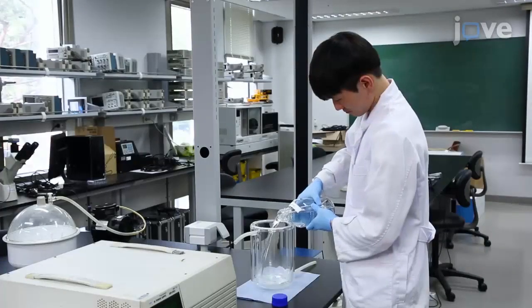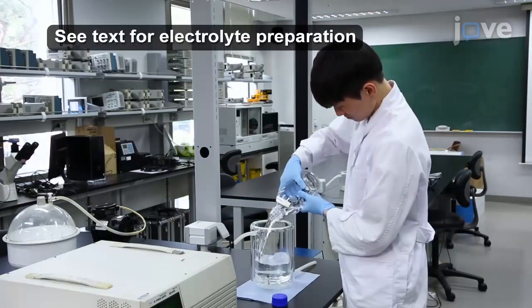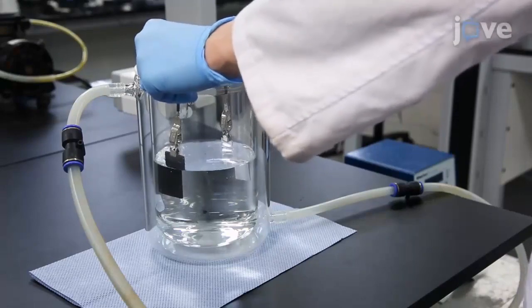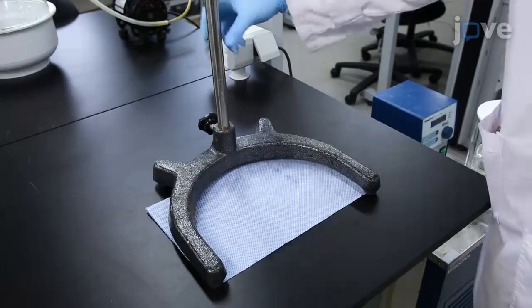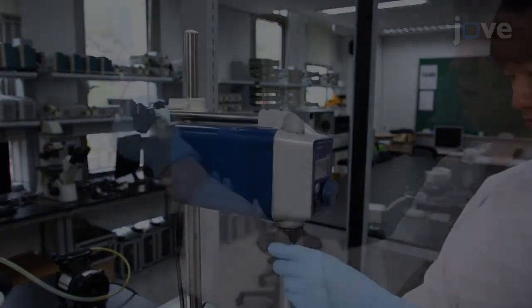To perform the primary anodization, pour 1 liter of the electrolyte into a 2-liter double jacket beaker. Immerse the polished aluminum plate and carbon counter electrode into the solution with crocodile clips and copper wire. Install a vertical shaft on a U-shaped pedestal, then attach an overhead stirrer and an impeller using metal clamps.